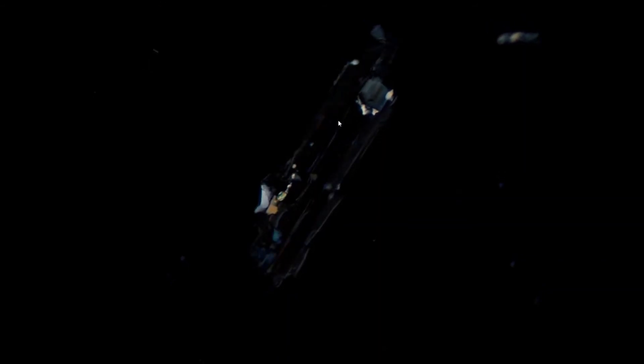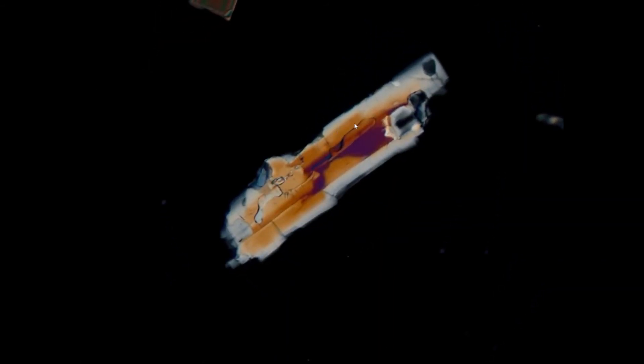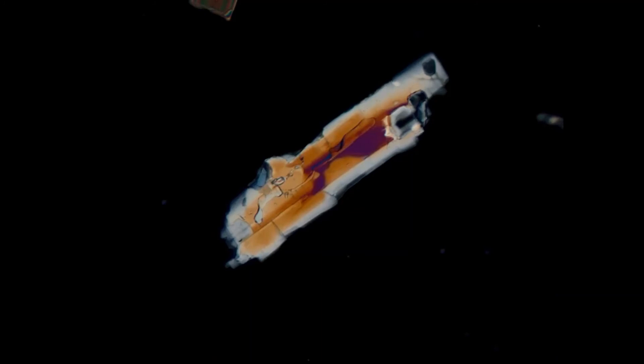If we rotate the grain into a north-east-south-west orientation to test for the elongation, we see that on the rim, this grain has these white and gray first order colors now. If we put our accessory plate, these change to blue, which means that this grain has positive elongation.